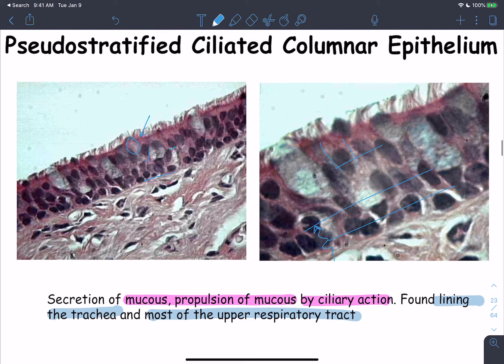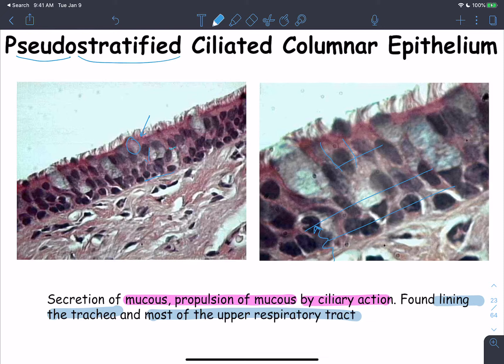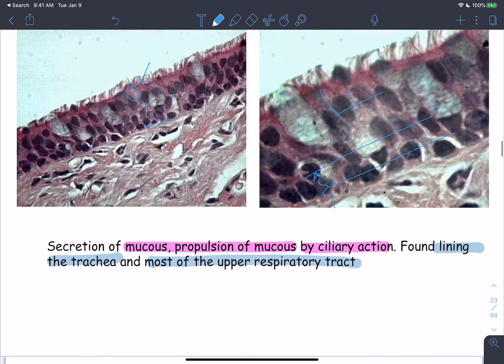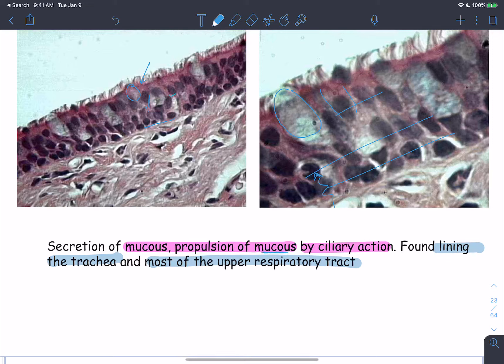We decided not to call it stratified or simple, but instead called it pseudostratified epithelium — pseudo meaning false or fake stratified. The pseudostratified columnar ciliated epithelium also contains large vacuolated goblet cells, also called mucus cells, which are responsible for the production of mucus.